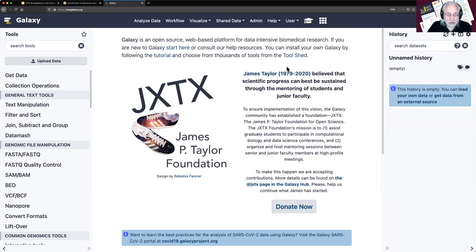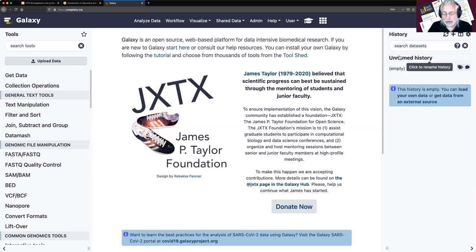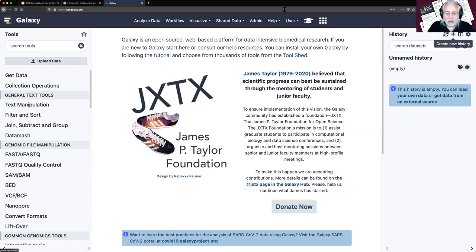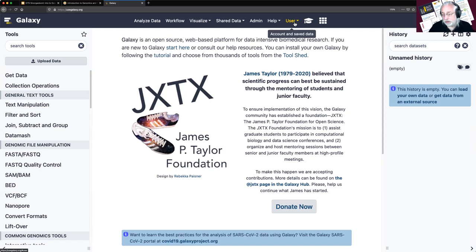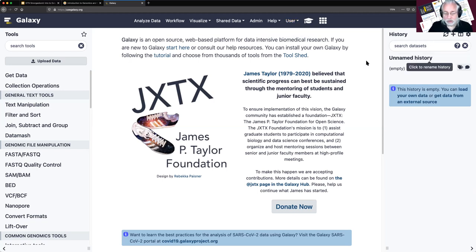So far you've gone to a Galaxy server and either created a login or logged in. The next thing you want to do is have an empty history. If you've used Galaxy before, it will show you the last history you had. You'll want to clear that by clicking the plus sign, which creates a new unnamed history. There are many advantages of using Galaxy after you log in — without logging in, you can only have one history and it will be lost when you close your browser.